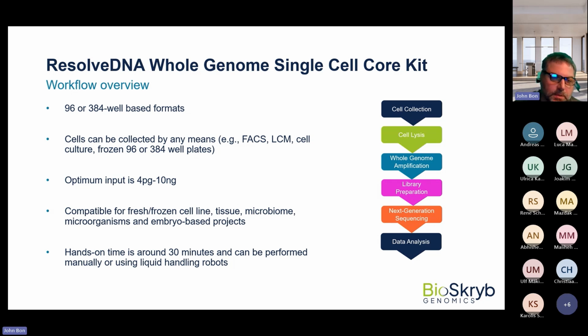If you want to use Illumina, you could use Illumina library prep. You could use our library prep, which is the ligation-based, Illumina-based method. Customers have used Oxford Nanopore, Singular, Ultima, and PacBio, and we'll talk about some of these later, but you could use other methods to sequence, not just Illumina. So just realize that as well.